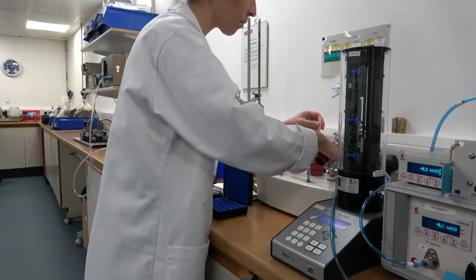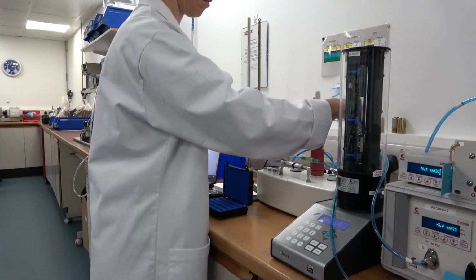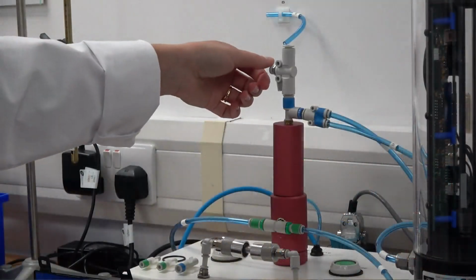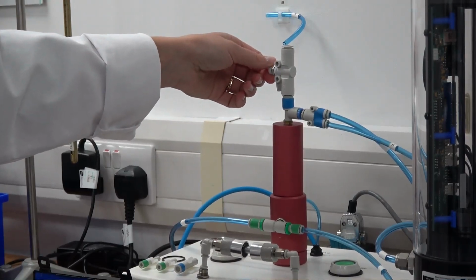The ventilation of multi-capillary standards is defined as the volume percentage, which is typically between 20% and 80% of the outlet flow from the standard that has entered via the ventilation pathway. This requires measurements of the ventilation flow, the outlet flow from the standard, and the pressure drop across the standard, which is used to compensate the ventilation inlet flow to the flow at the outlet.